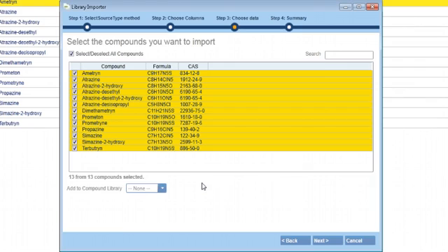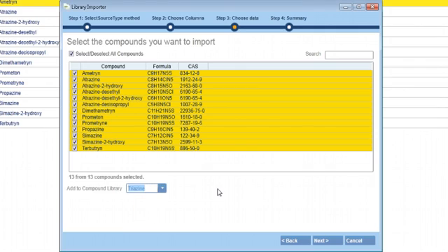Once you've selected your compounds, you can add them to an existing library or create a new library by simply typing in a new name in the Add Compound Library box.